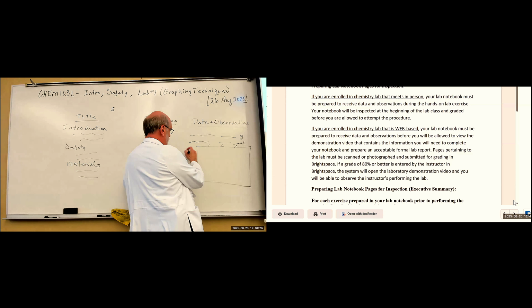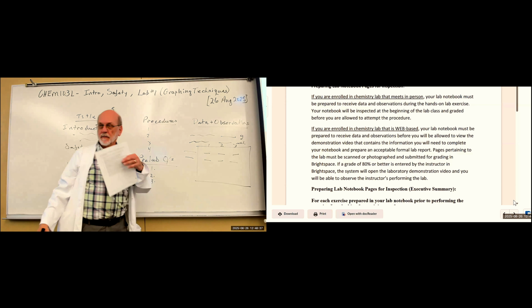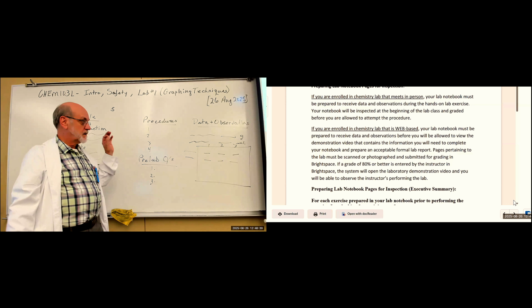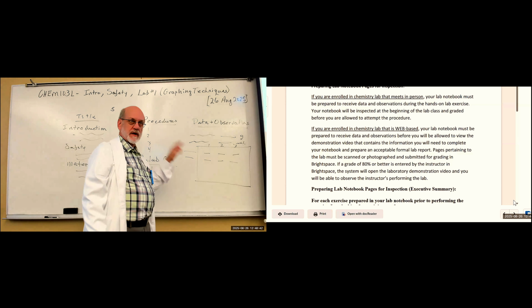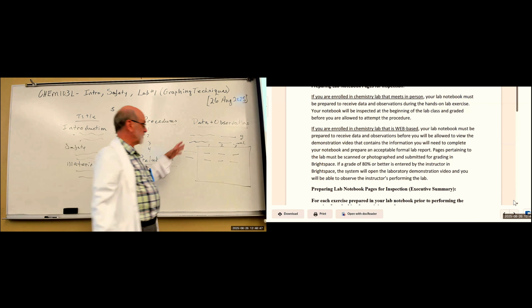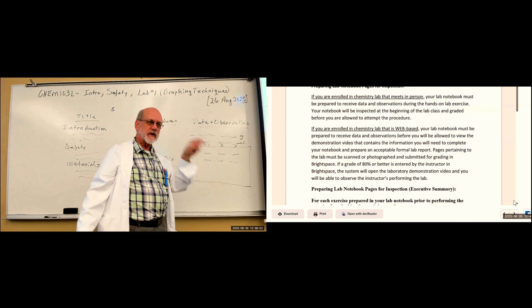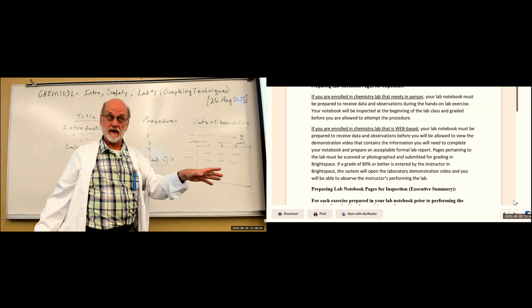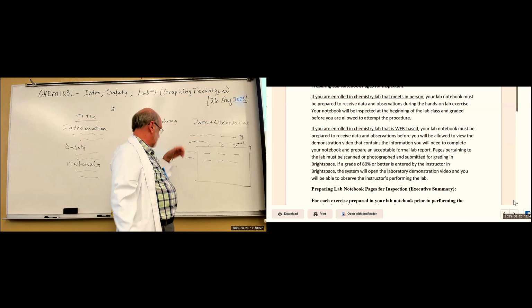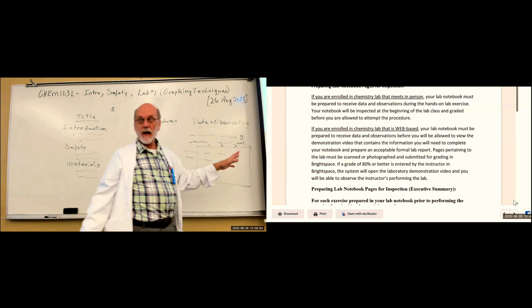You have 3 reps. You're going to have something here, and you're going to have rep 1, rep 2, rep 3, those values. And then another here. And organizing in a table allows you to know if you've goofed up, if you skipped a step. If you lay it out like this or like this, and you have set it up so that you're supposed to put numbers in there, or you're supposed to put observations in there, and you get down to a step in your procedure that goes in right here, and these are blank, stop.